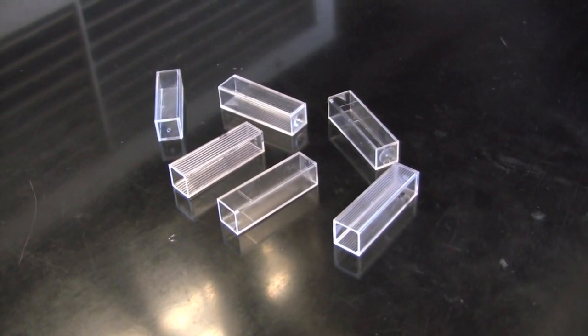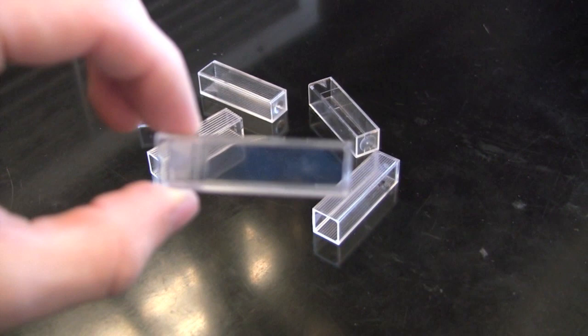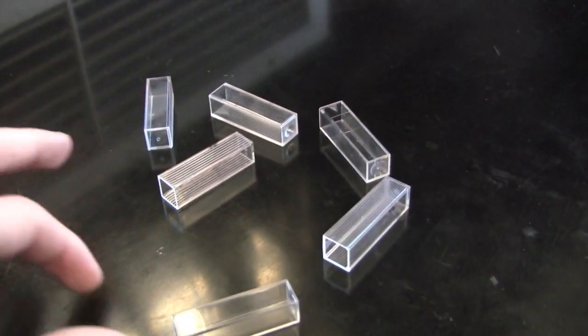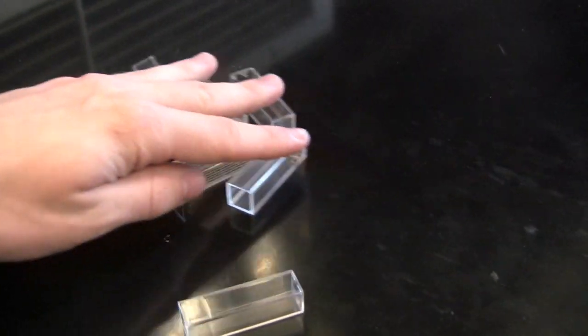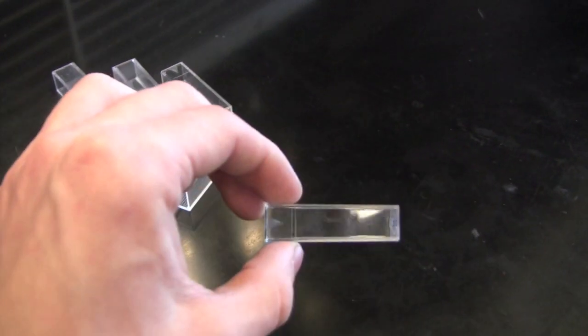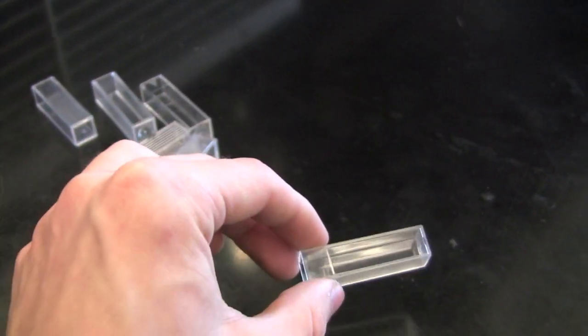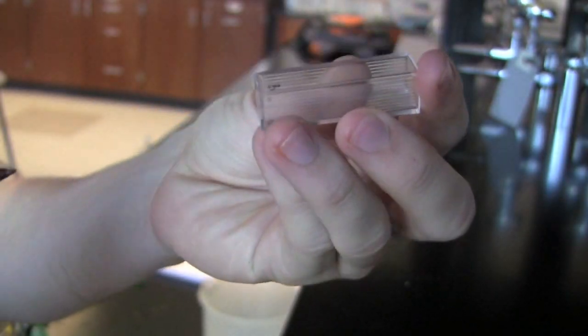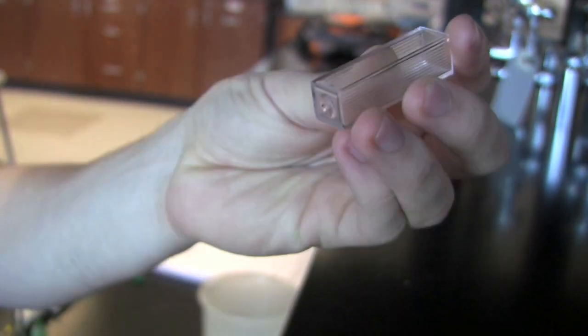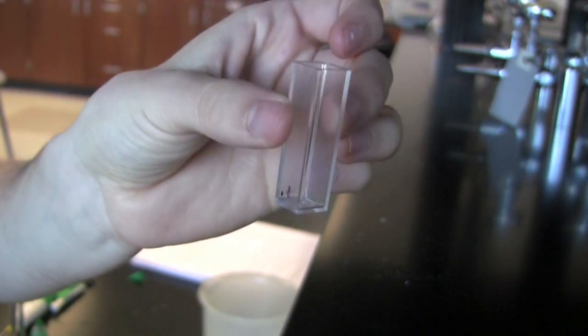Gather 6 cuvettes. Make sure two opposing sides are completely clear with no scratches and no scuffs. You'll need five of these cuvettes for the different concentrations that you made. Now this other cuvette will be used for an unknown concentration. Mark each cuvette with a number. This will allow you to know which cuvette has which solution and also remember to mark the cuvette with an unknown solution.